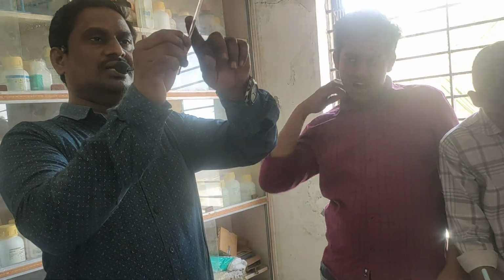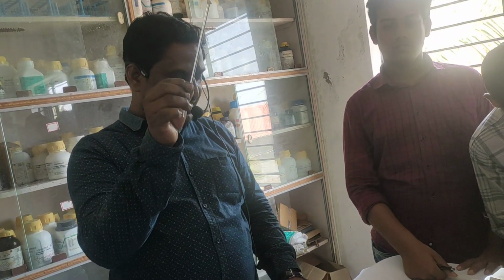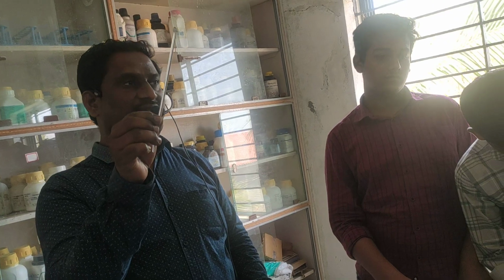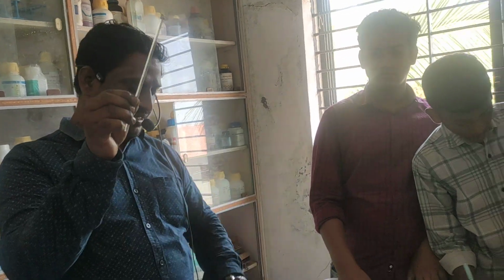What do you observe? Brick red colored flame. The result is Ca plus 2 is confirmed.